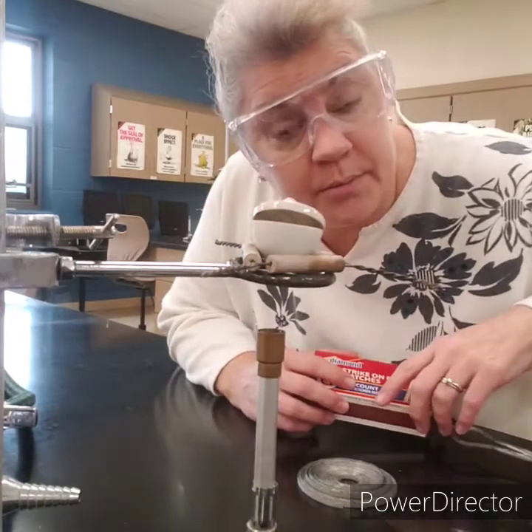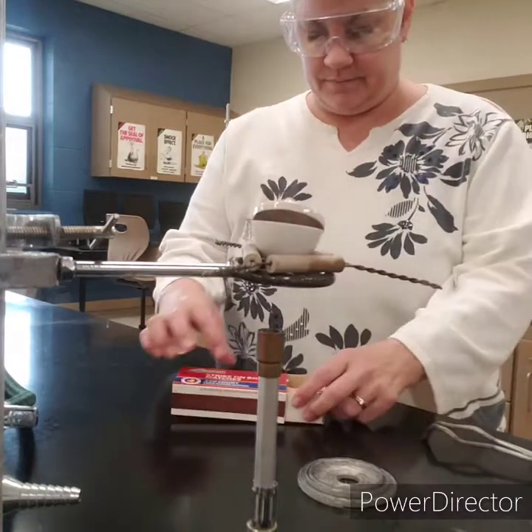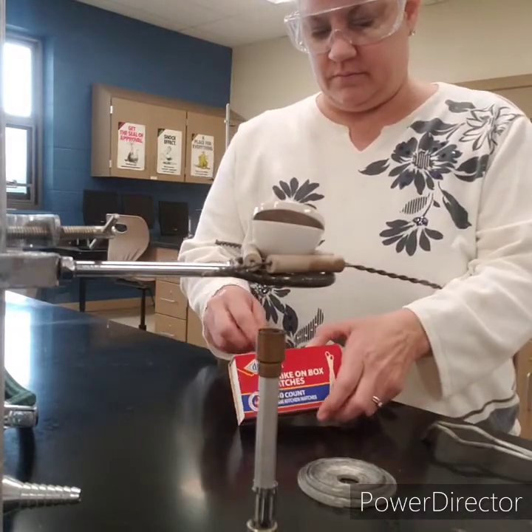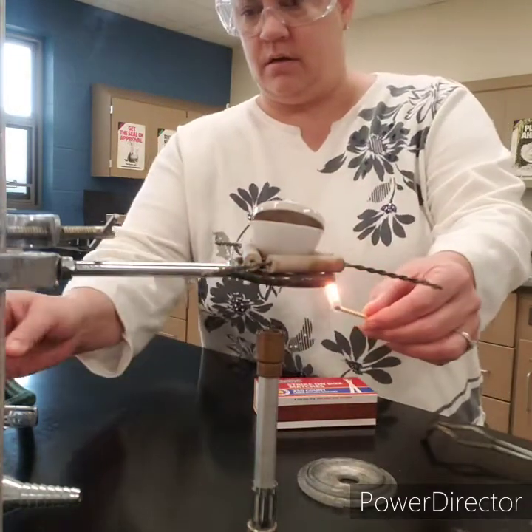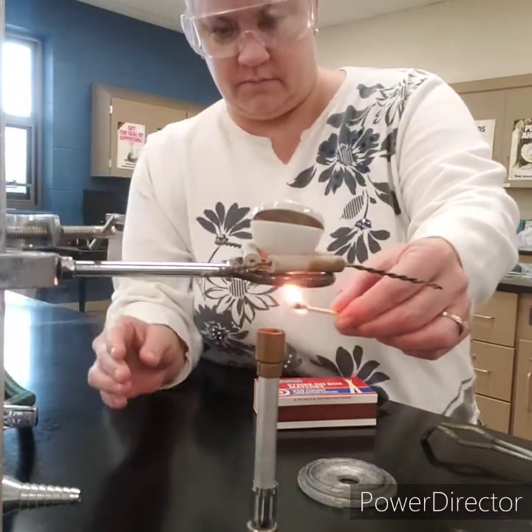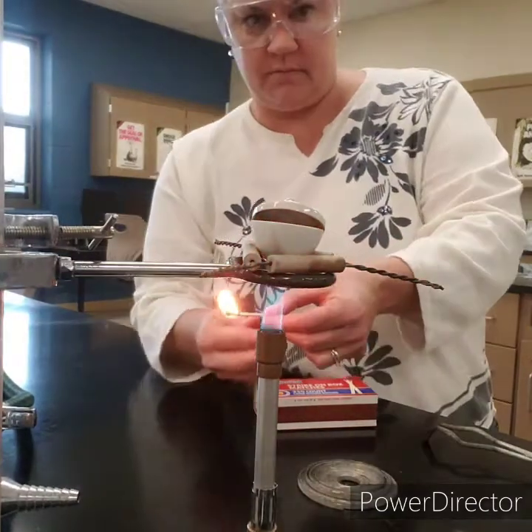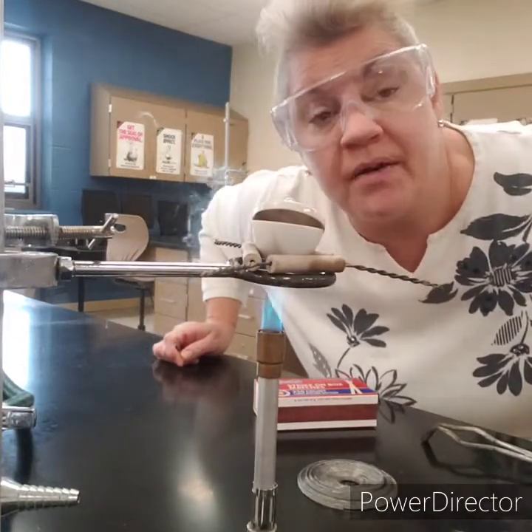Remember how to light a Bunsen burner: first light your match, then turn your propane on. Now we're going to heat this magnesium ribbon for about five minutes.